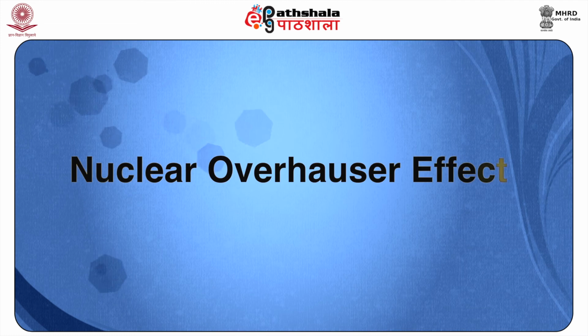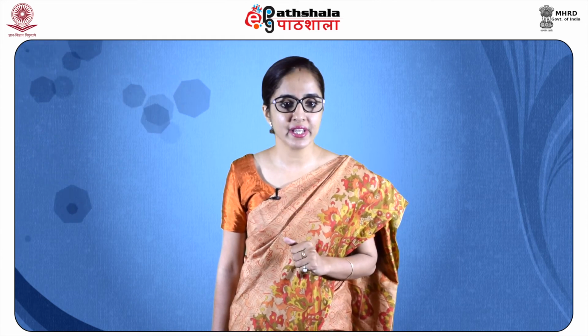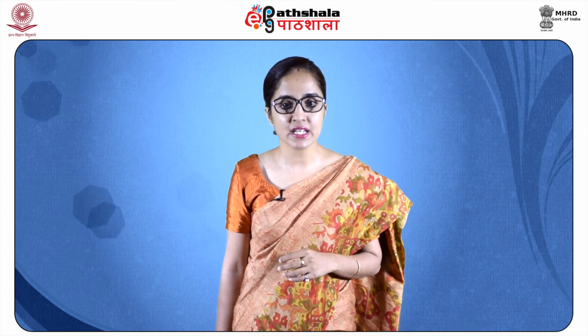Now comes a very important effect in NMR, known as the nuclear Overhauser effect, and we will study how it simplifies the NMR spectrum. The nuclear Overhauser effect, students, was first introduced by Overhauser in 1953. This effect is a change in the intensity of a signal due to a particular proton on double irradiation of nearby protons within the molecule.